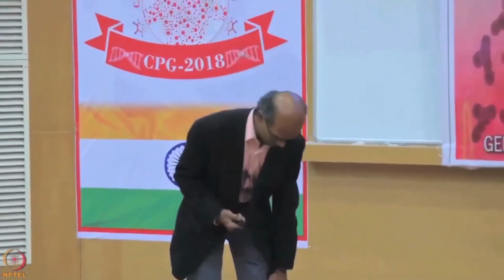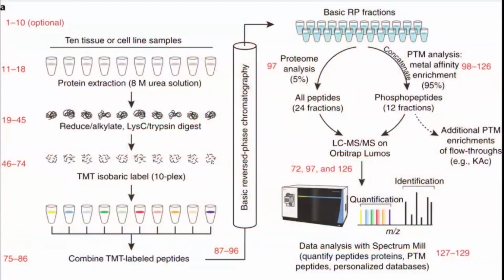Right now, I think the answer is no. I think the NCI is trying to come up with something like that, but right now there isn't anything you can get from some lab or some institution to share across labs. Yeah. So in your slides, there is a reference to a paper in Nature Protocols. That was a standardized protocol for TMT10 derived from all the CPTAC labs and has been published. So if you want a standard protocol for TMT, that's a good place to look at.